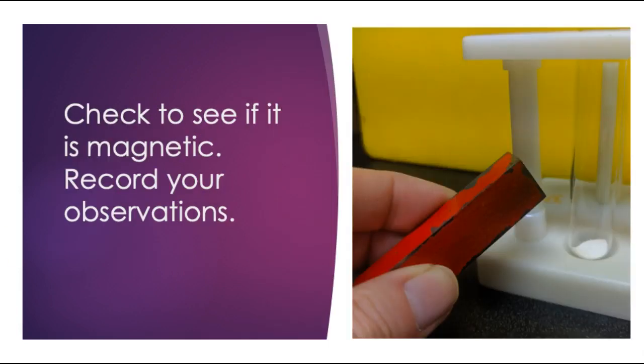Next, check to see if it's magnetic. All you have to do is put the magnet alongside the test tube. If it's magnetic, it will actually be pulled towards the magnet. Make sure that you record your observations down in the tick and flick sheet. So check each one of those powders before you move on.